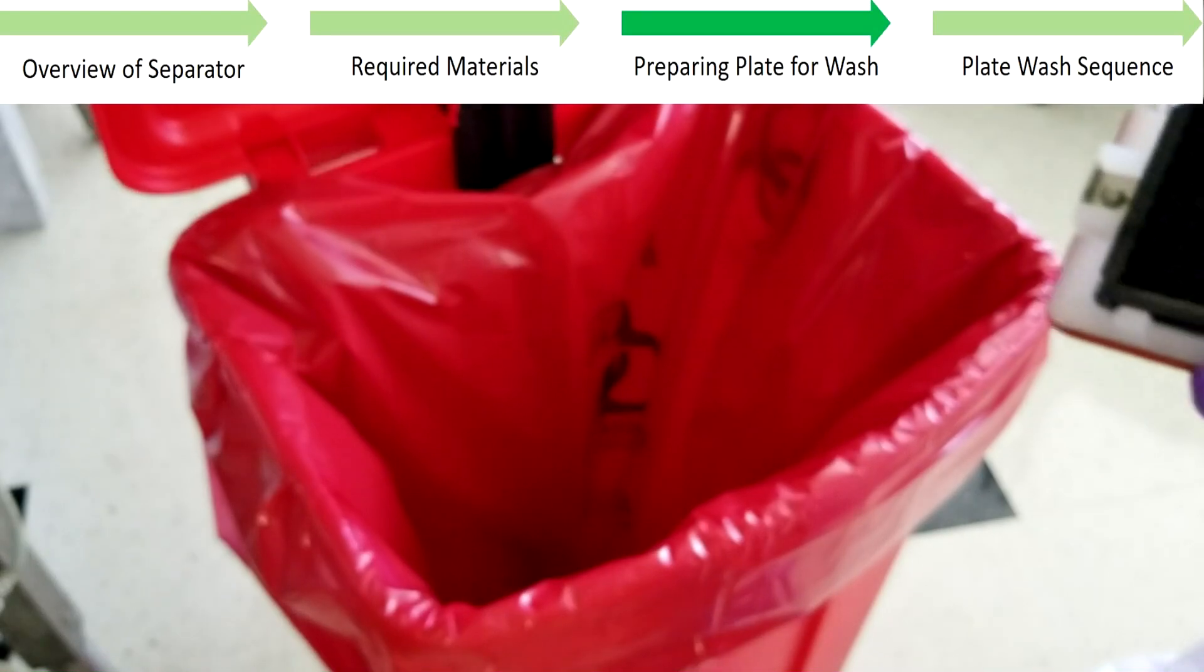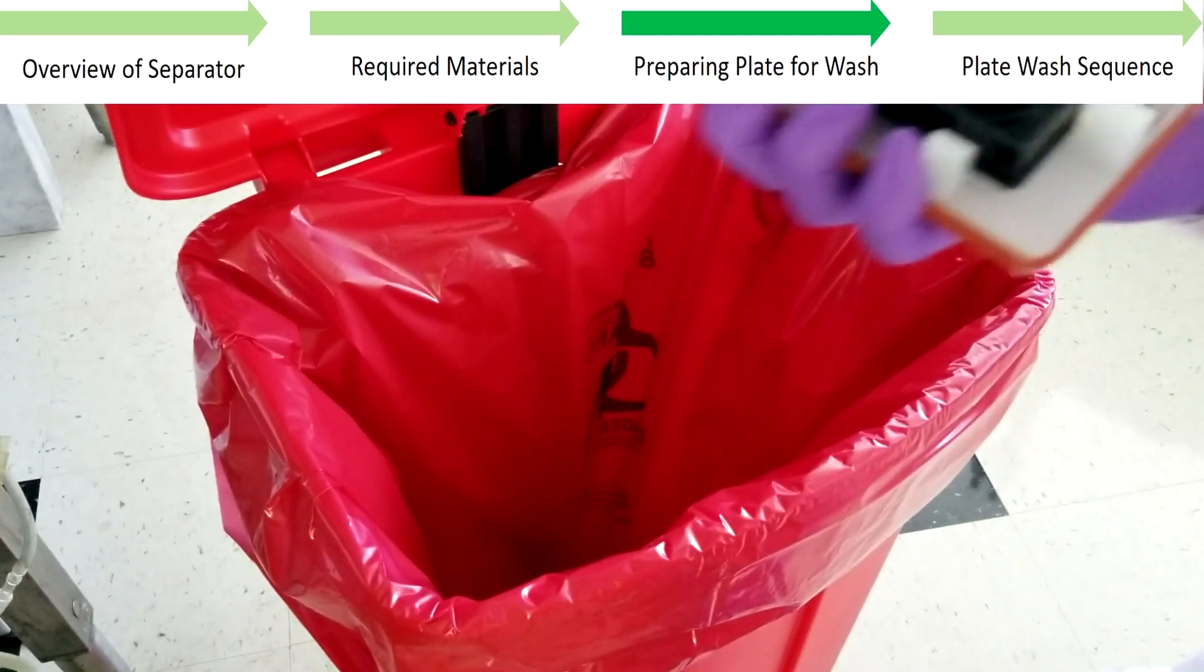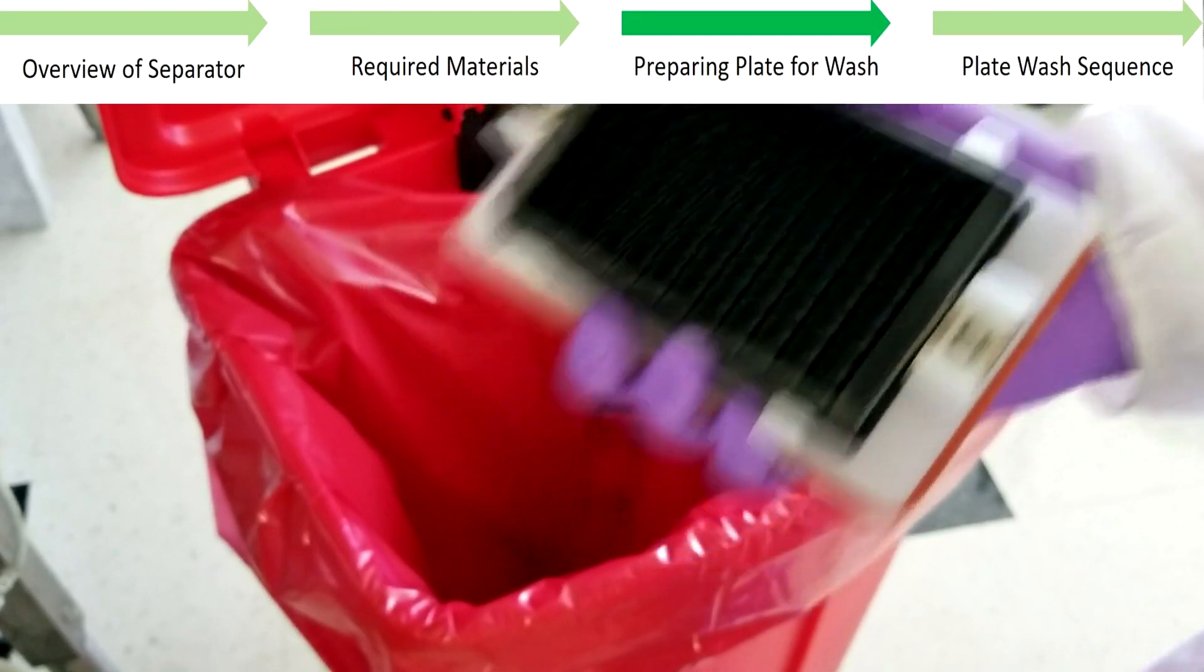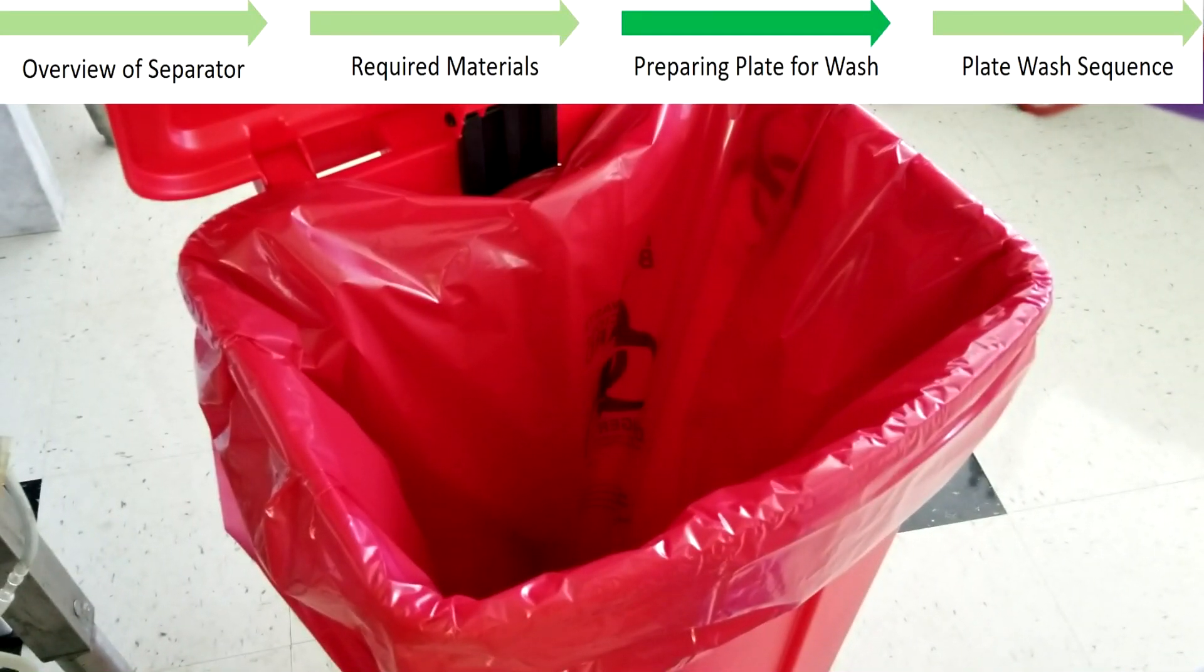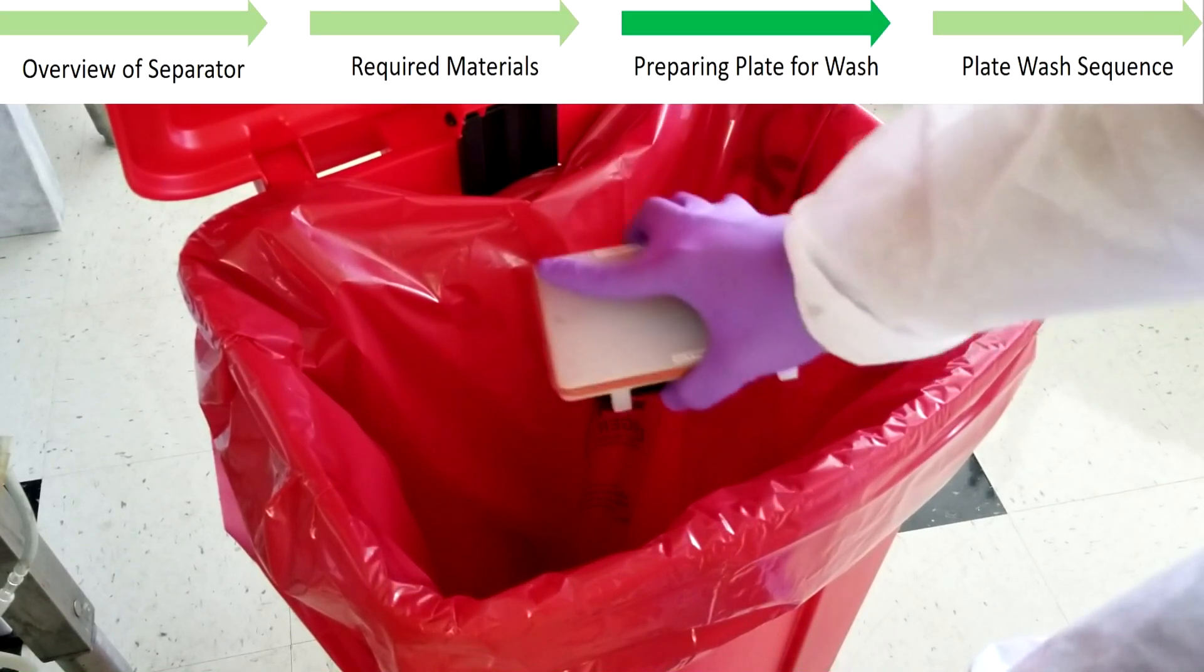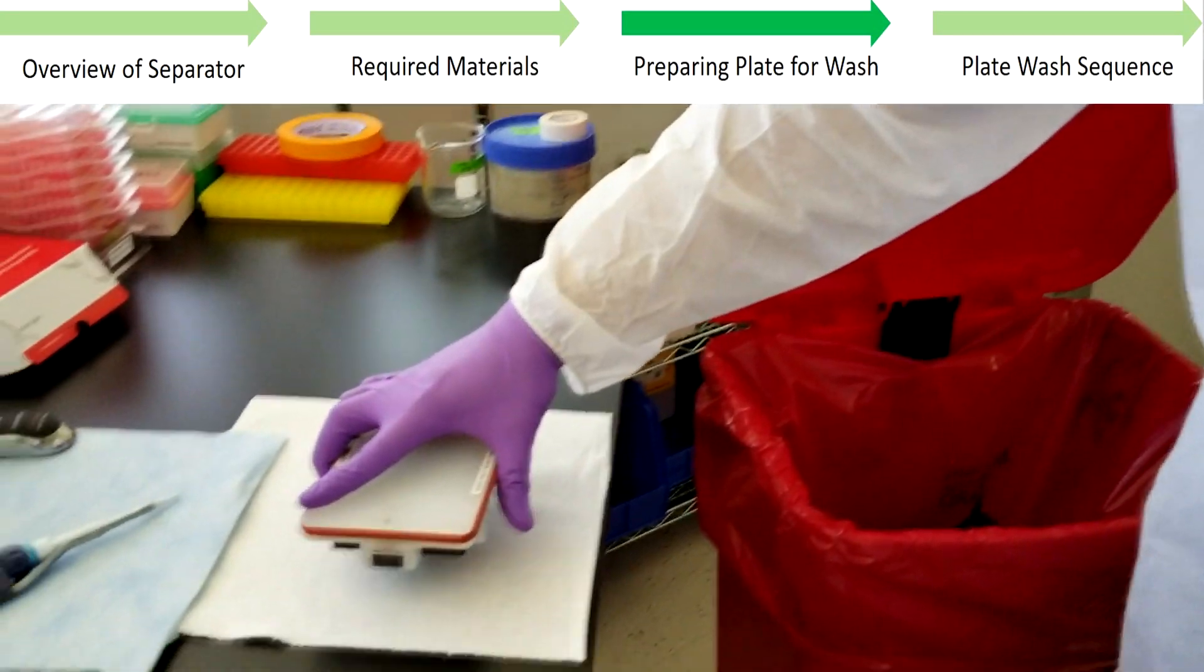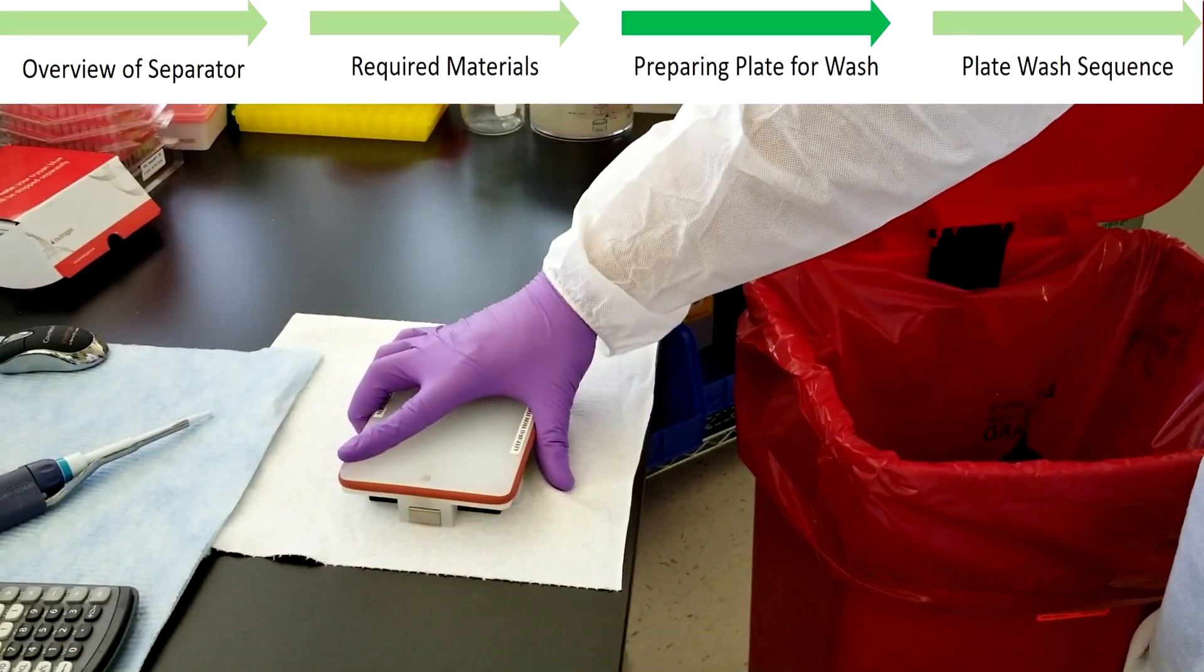Next, carefully remove the adhesive seal and pick up the separator by its base, with the assay plate still locked in. Invert it over an appropriate waste container and use strong downward force to eject liquid well contents while leaving the beads undisturbed. Briefly dab the assembly on a clean paper towel.